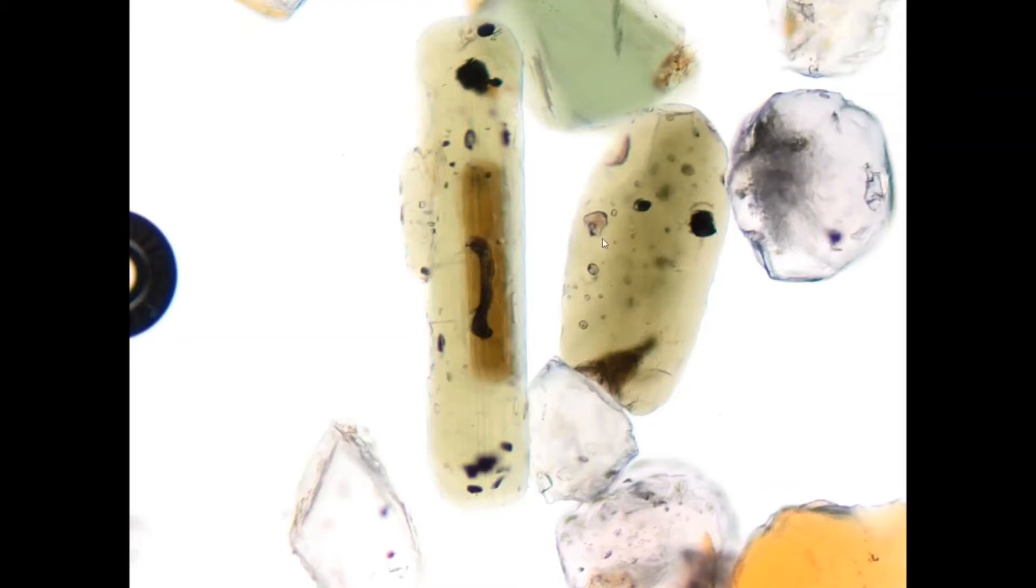These two grains in the center belong to the same species. They are green in color, have moderate relief, show quite some inclusions, and they are prismatic or rounded in habit.